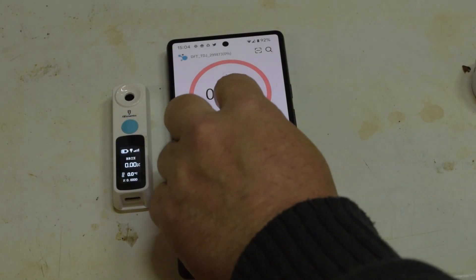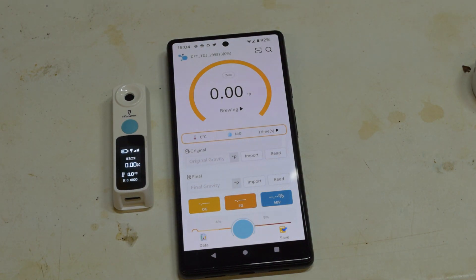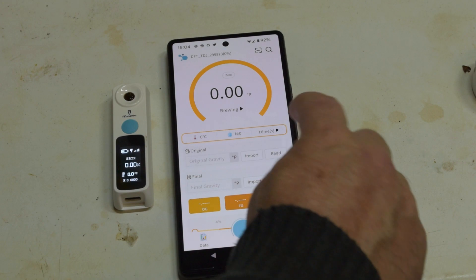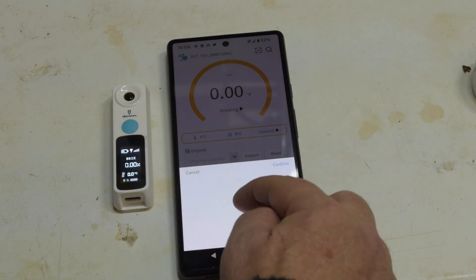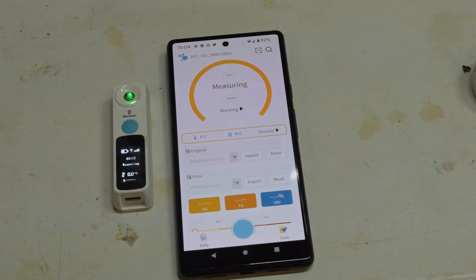Once you've installed the app and paired it with the device, you simply choose that you want to use this with beer and the beer screen comes up. You then place a few drops of your wort onto the measuring surface and press the measure button. You can also select to do several measurements to get a better average. It will then take the measurements — in this case five of them — and present you with a result, initially in Plato.